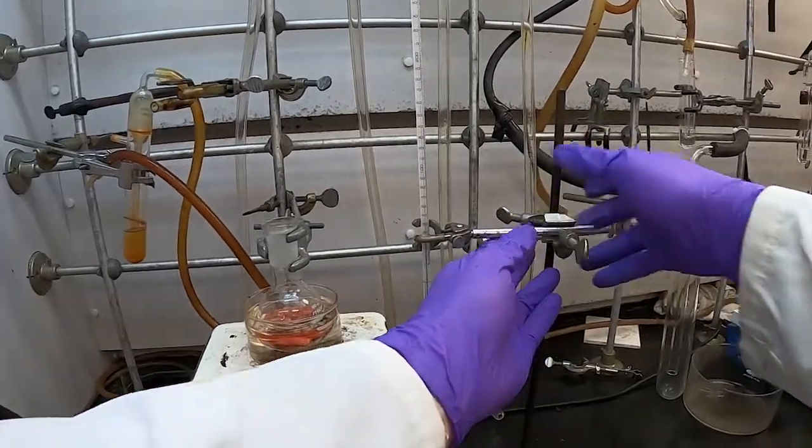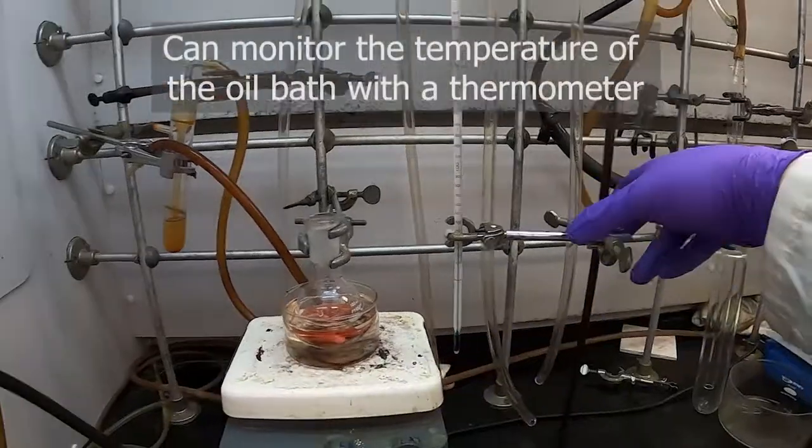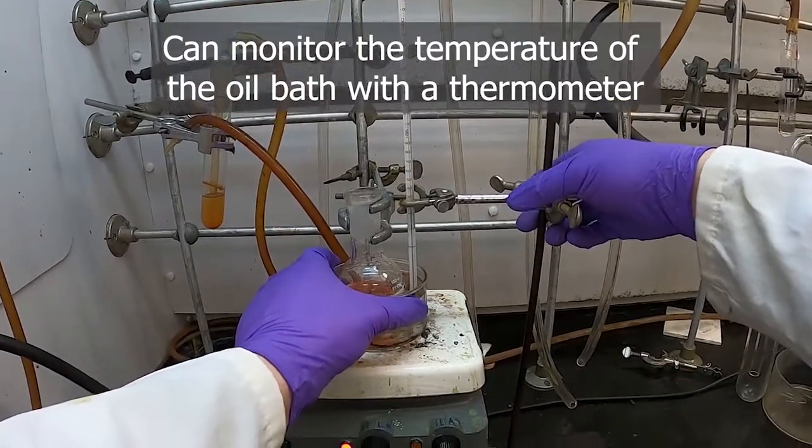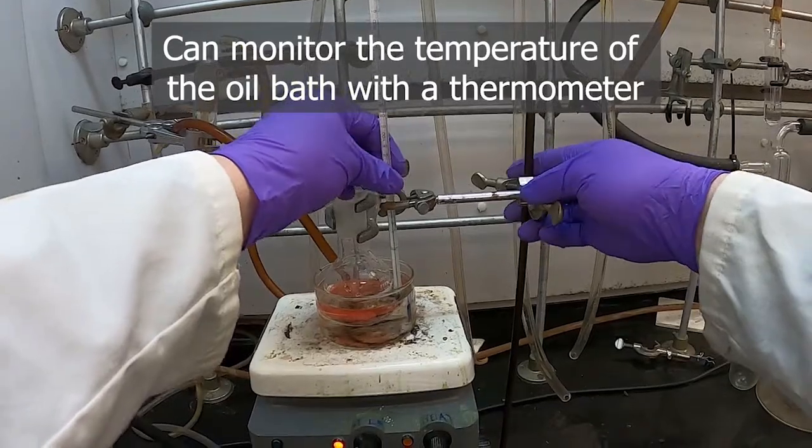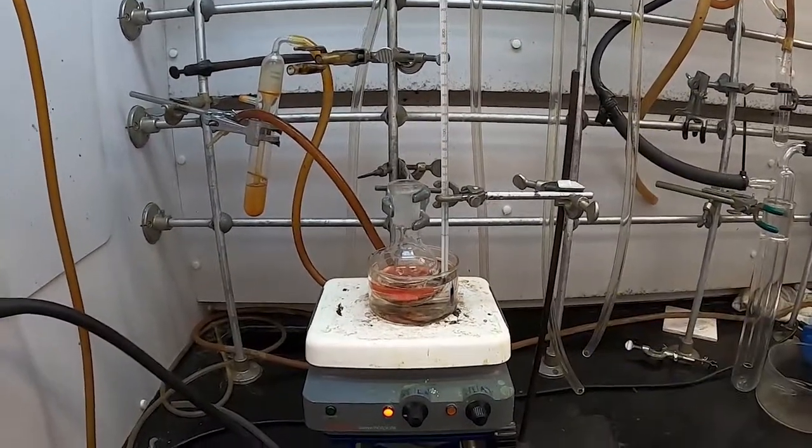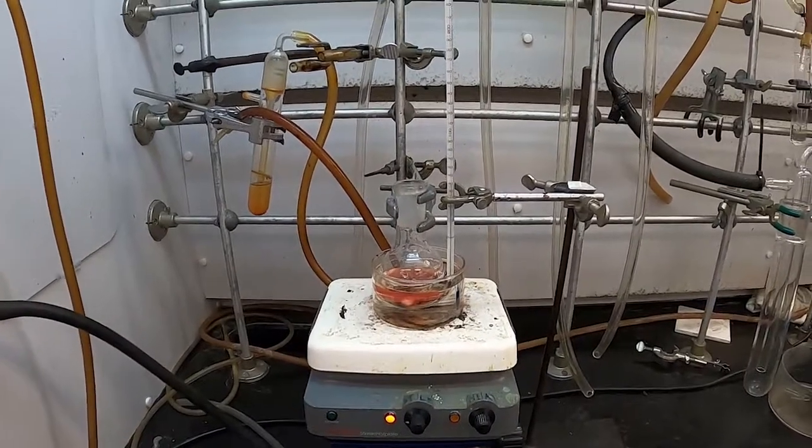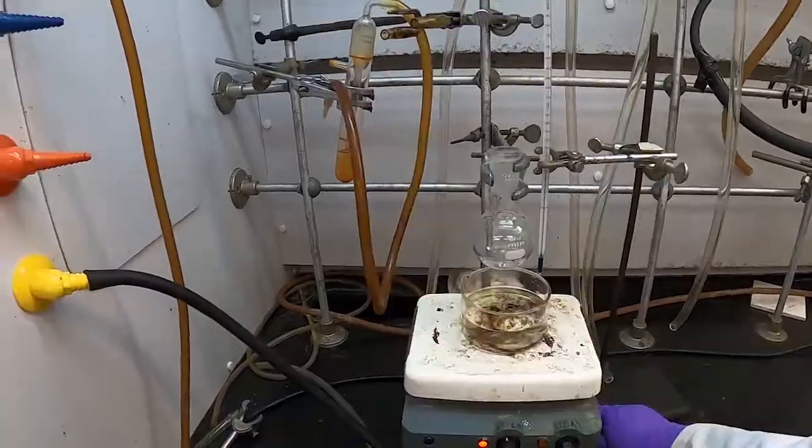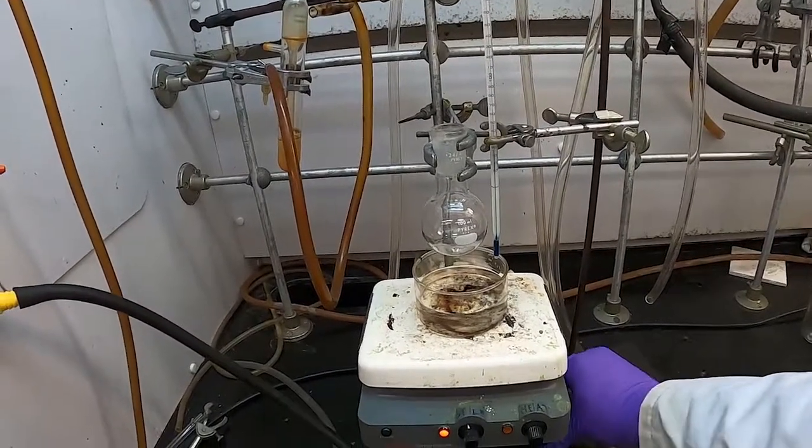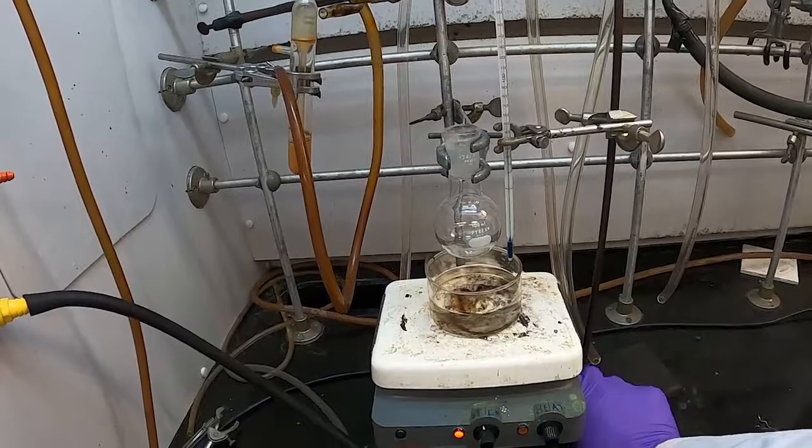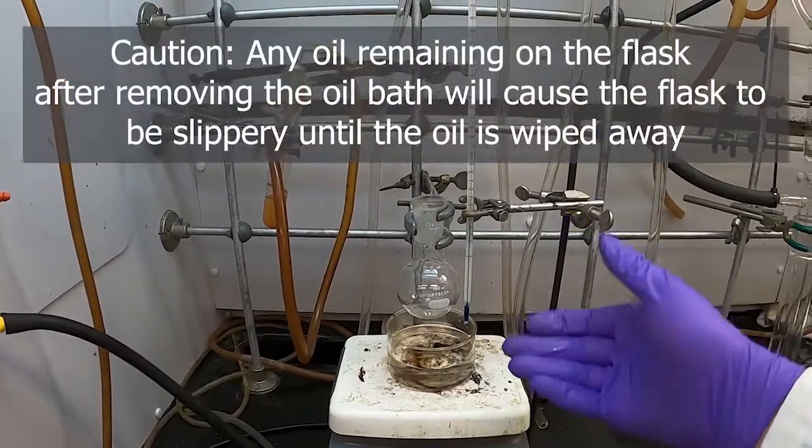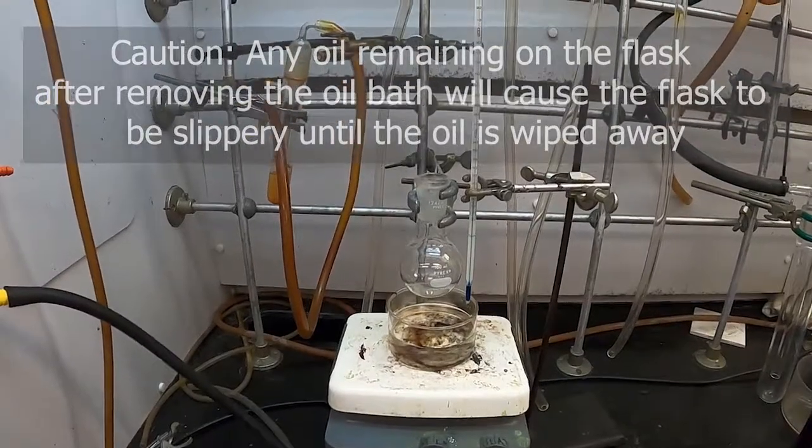As with water bath, if we want to know the temperature of our oil, we can use a thermometer like this one. We also though don't want it to touch the bottom of the bath. That will help us get the most accurate temperature. And it's important to not stir our oil baths with thermometer and to avoid using mercury thermometers with oil baths as they can get hot enough to break them. With oil baths, especially if you're using them when it's hot, when you really need them hot or hotter than 100 degrees like a water bath, it's very helpful to be able to raise the heat to your flask. This also allows you to drop your heat away and let the oil excess oil drip off your flask before moving on to the next step of your reaction.